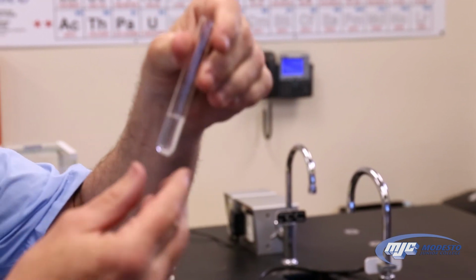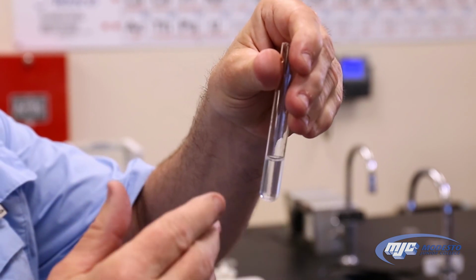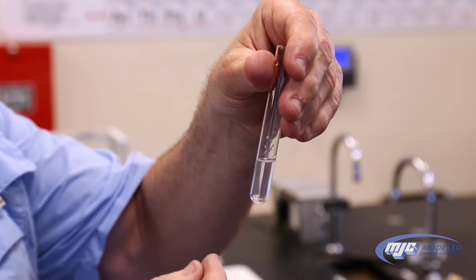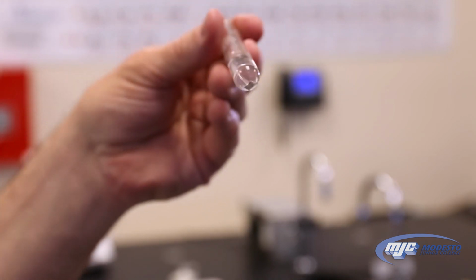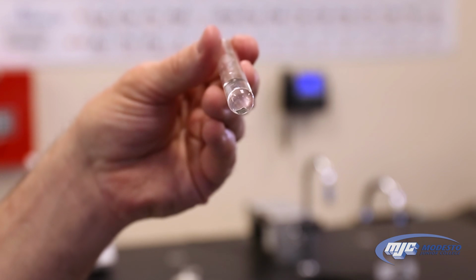So if it's magnesium sulfate, then you will see some small amount of bubbles. That's just the magnesium reacting with the water, but it will not get dark like it did before. So that's what it would look like if you had magnesium sulfate, no dark coating on the piece of magnesium metal that you put in there.